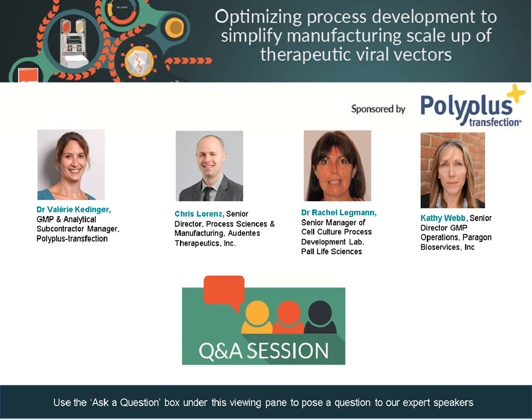Yeah, hi, hello, everyone. Alingo, I think in one of her slides highlighted that ideally you keep the same method of preparation as you scale. Absolutely, I think that's important. But unfortunately, as you go from, say, 1 liter or benchtop scale up to 500 liter as we're at with Audentes Therapeutics, there are just operational logistics that get involved that end up being quite challenging.